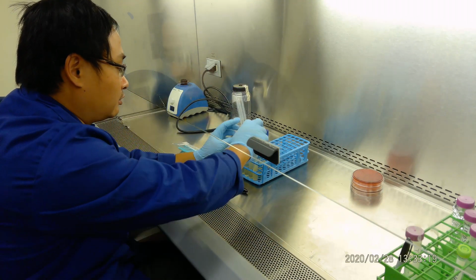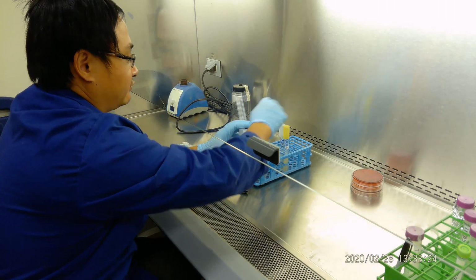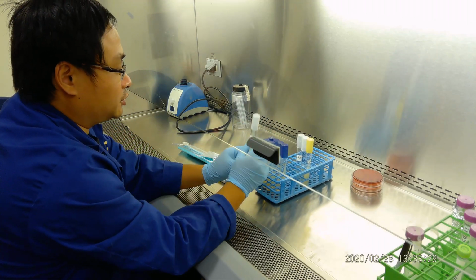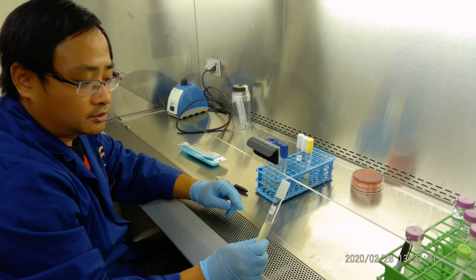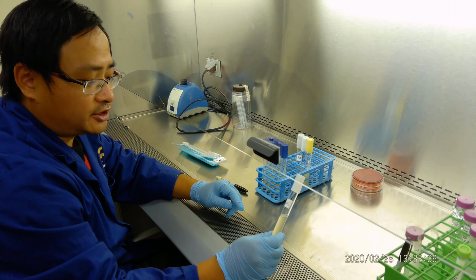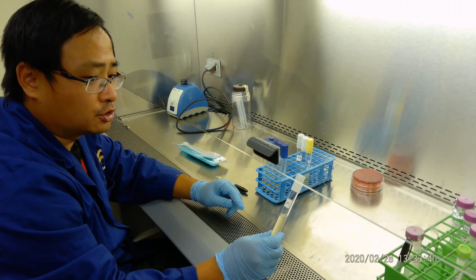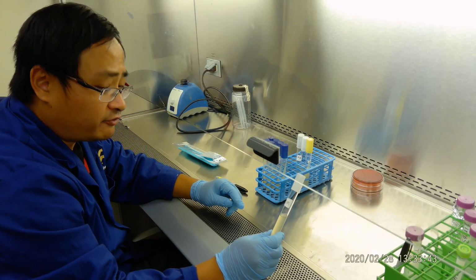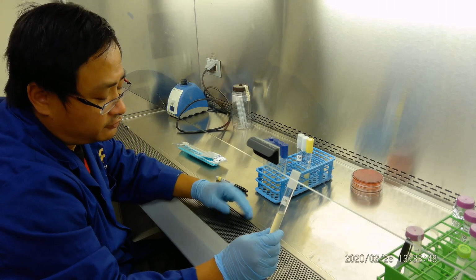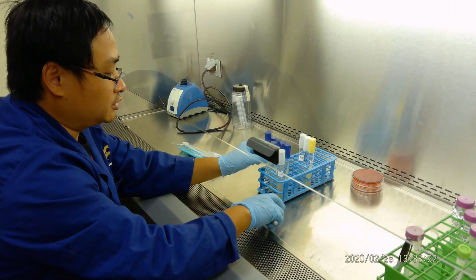Now the second job of what we're going to do is to see how bacteria survive at different temperatures. The first thing we're going to do is Serratia. So let's take a picture right here. Serratia is a very special bacteria. This bacteria will grow at 25 degrees Celsius showing red color, and at 35 to 37 degrees Celsius it is colorless. So sometimes you use this as a marker for tracing.